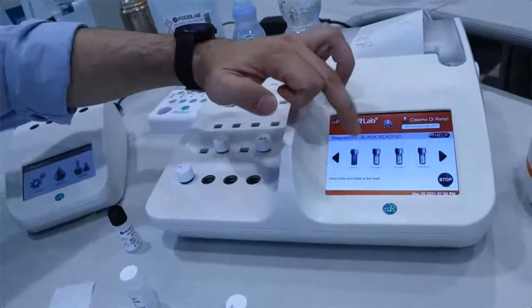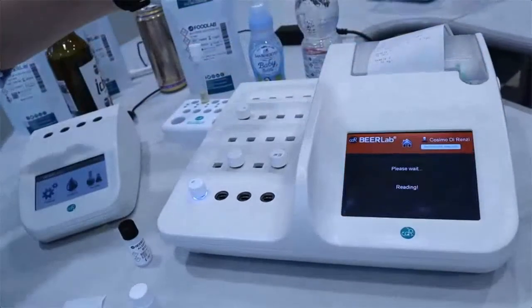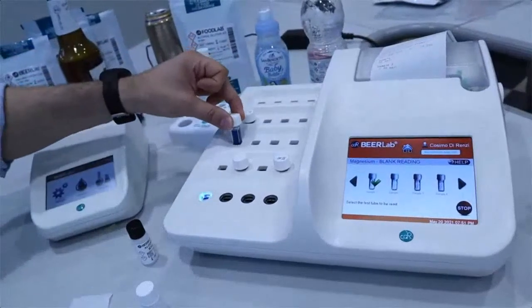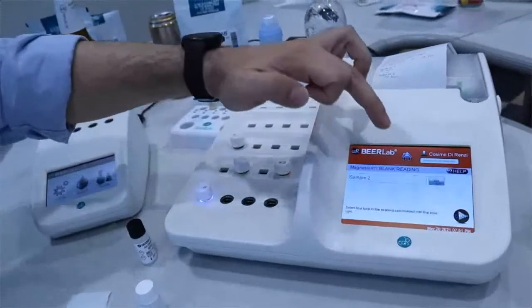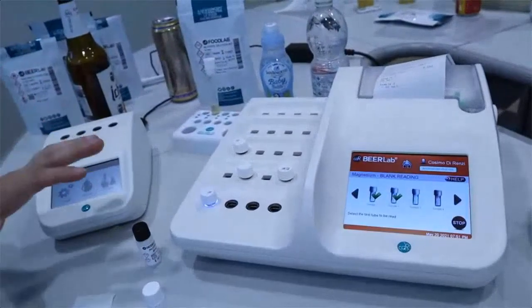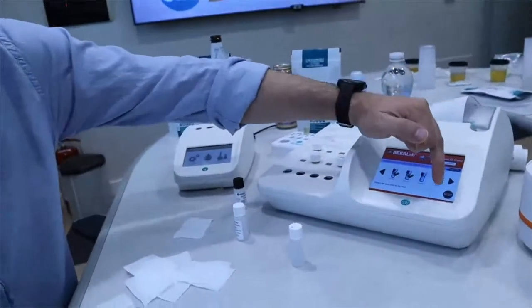We select sample 1, and we read the blank, the starting point of the reaction. As you can see here, sample 2, and we move ahead with the sample 2. So cuvette 2, we select sample 2, and we read it. So now we are doing two analyses of magnesium in water. At the end of the session, we press stop.